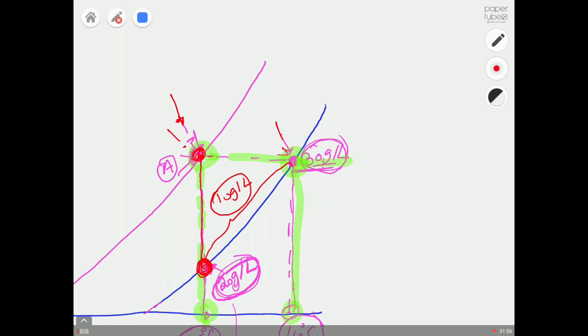We already know what the solubility line is, and we already know what the metastable zone width is. From this graph, we can easily pick the right process conditions where you can completely eliminate the nucleation process, but we can grow the crystals at that condition.